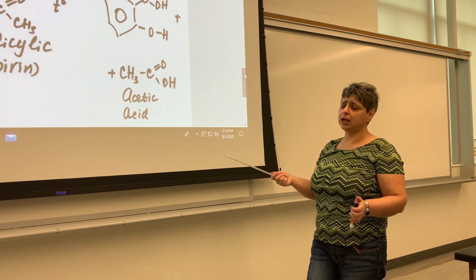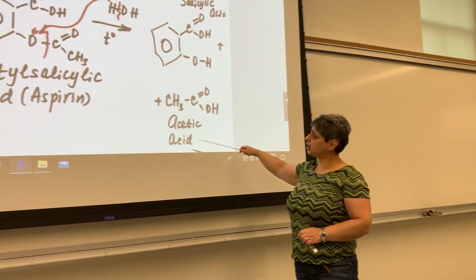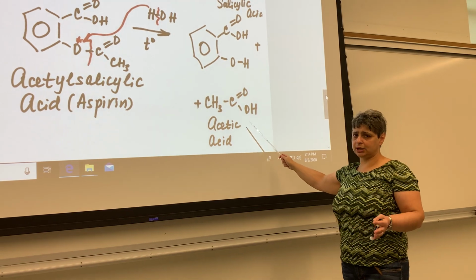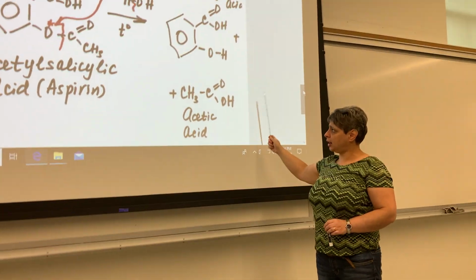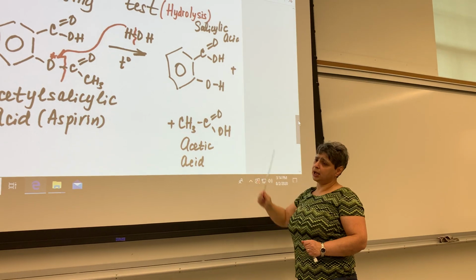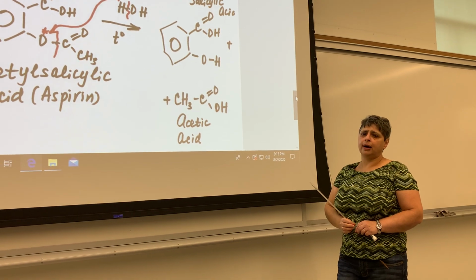How could you tell if that aspirin would not be safe to take? Simple, you open the bottle and you quickly smell it. And if you happen to smell any vinegar-like smell, of course it's not like smelling a bottle of vinegar, but if you are able to smell even a faint smell of vinegar, you know that aspirin has begun to hydrolyze and would not be safe to take. So I think it's an important point to make here.